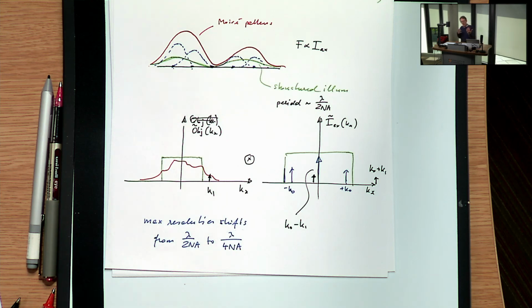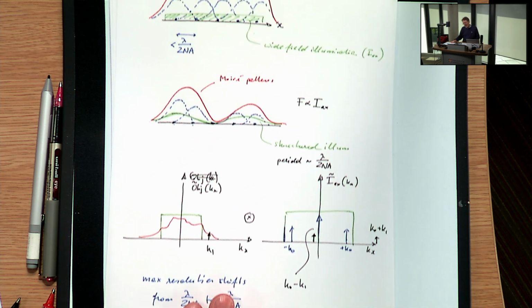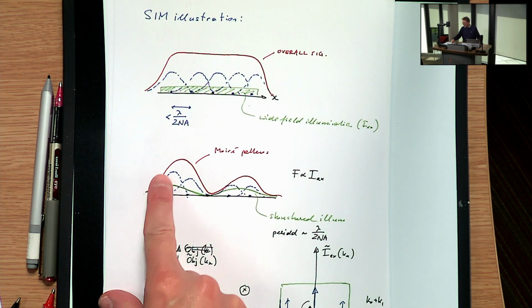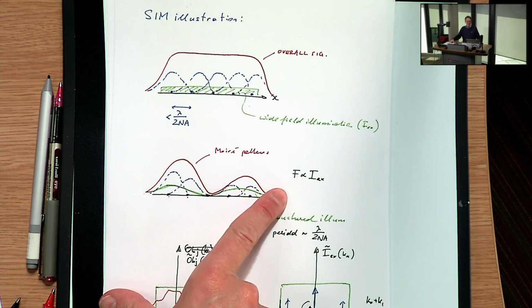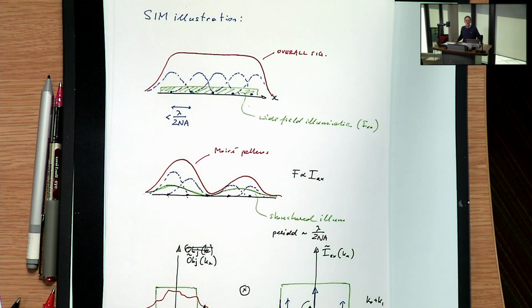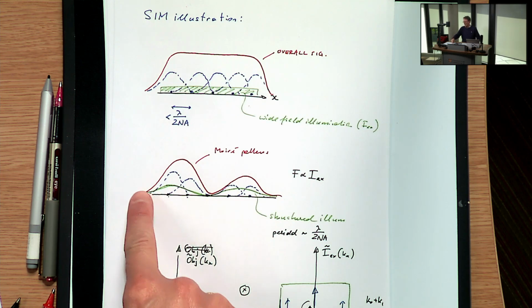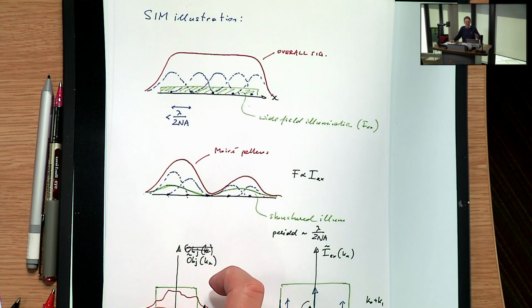And as I said, the trade-off between speed and resolution seems to be almost optimal in this technique. And again, our general principle applies. You gain resolution by switching molecules off, right? You're switching that one off, for example, here. By suppressing that, you can get more information about the other ones. That's the key, as has always been the case.